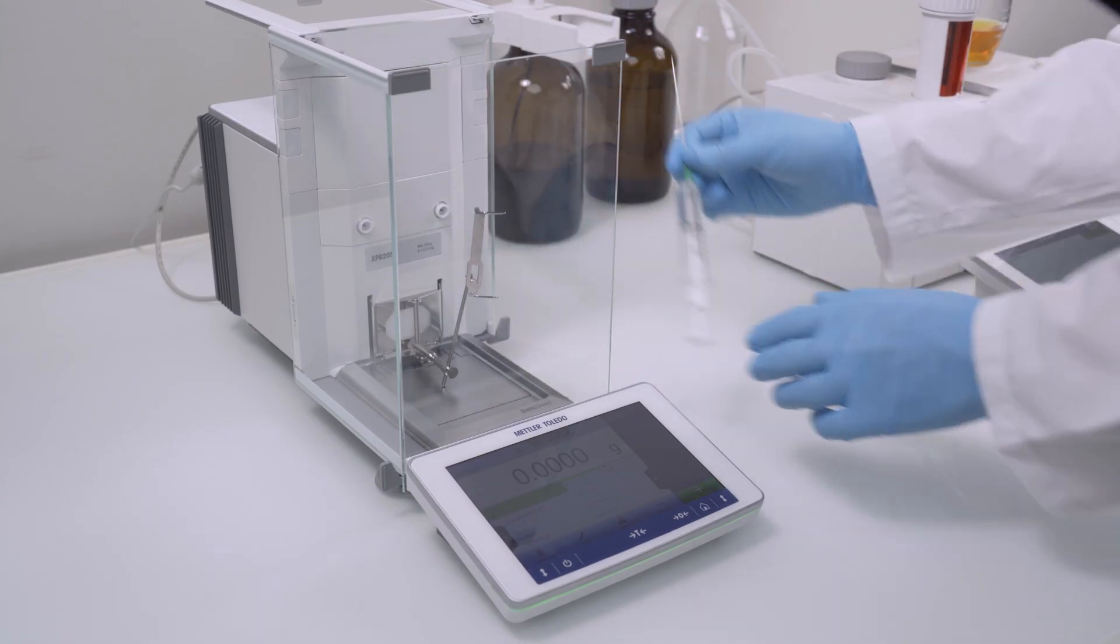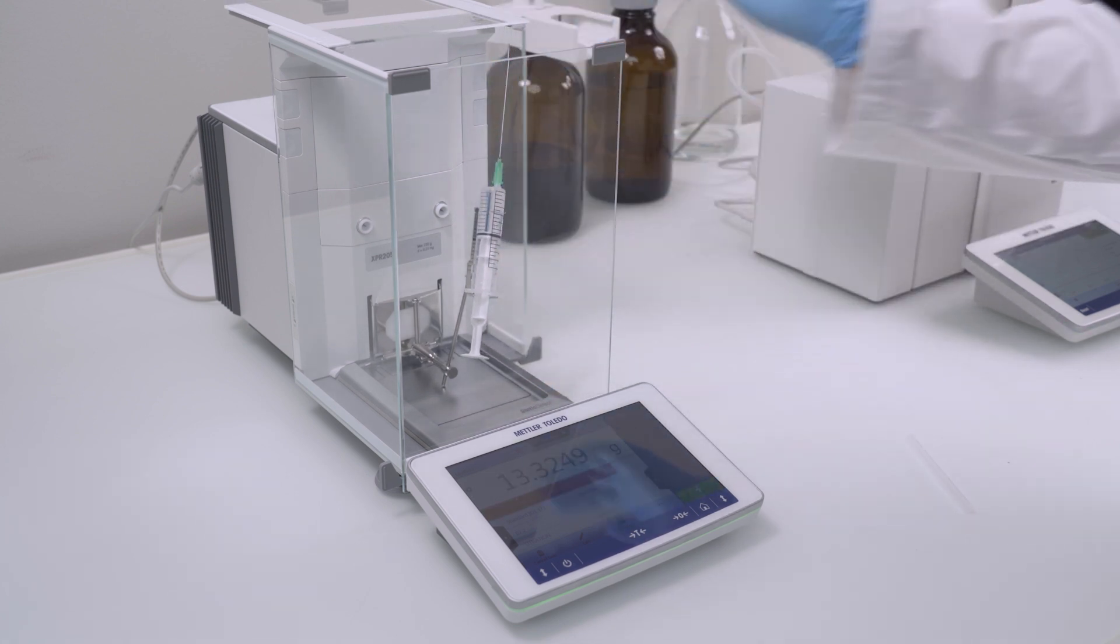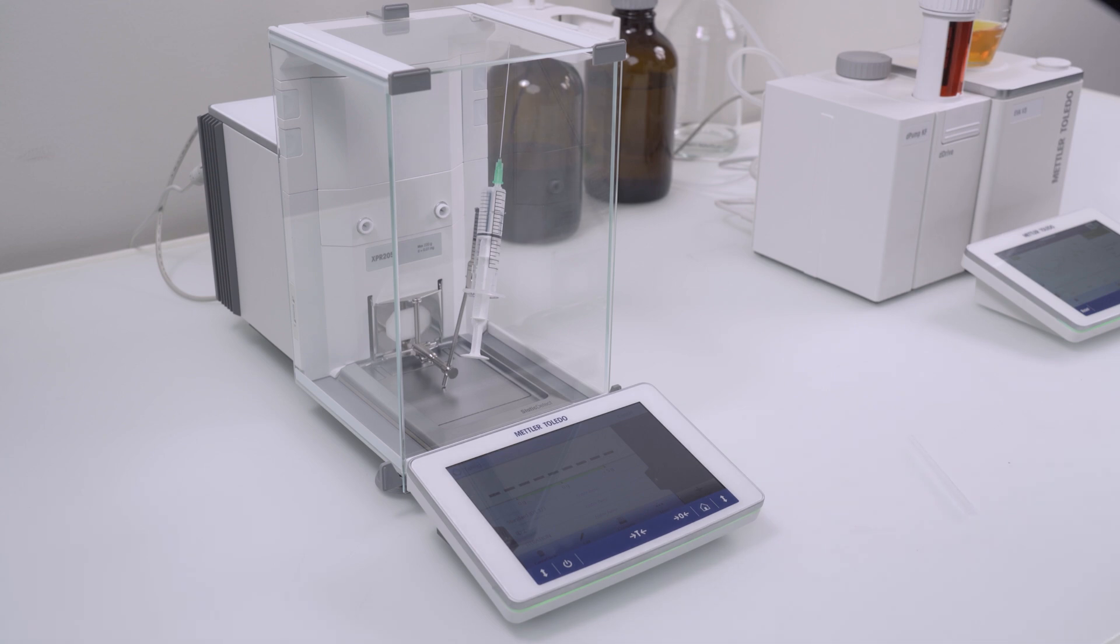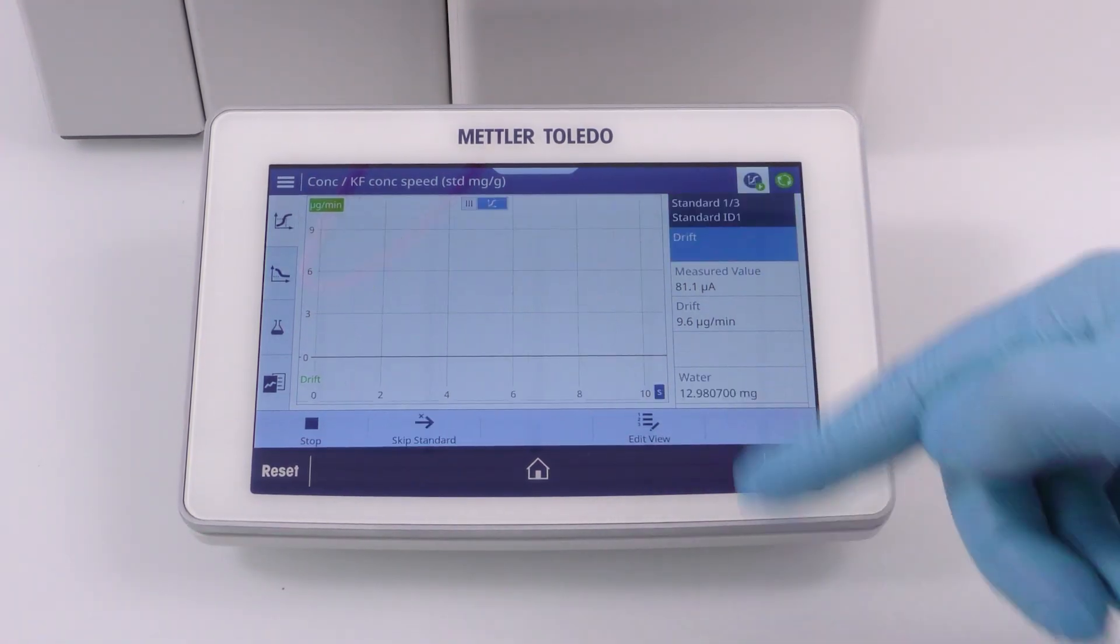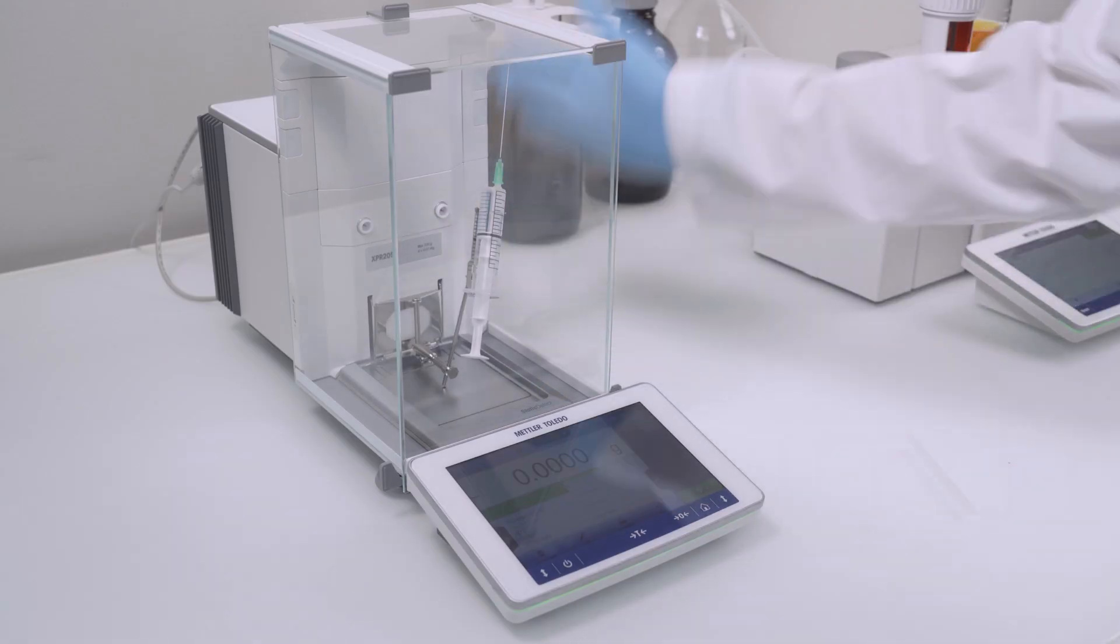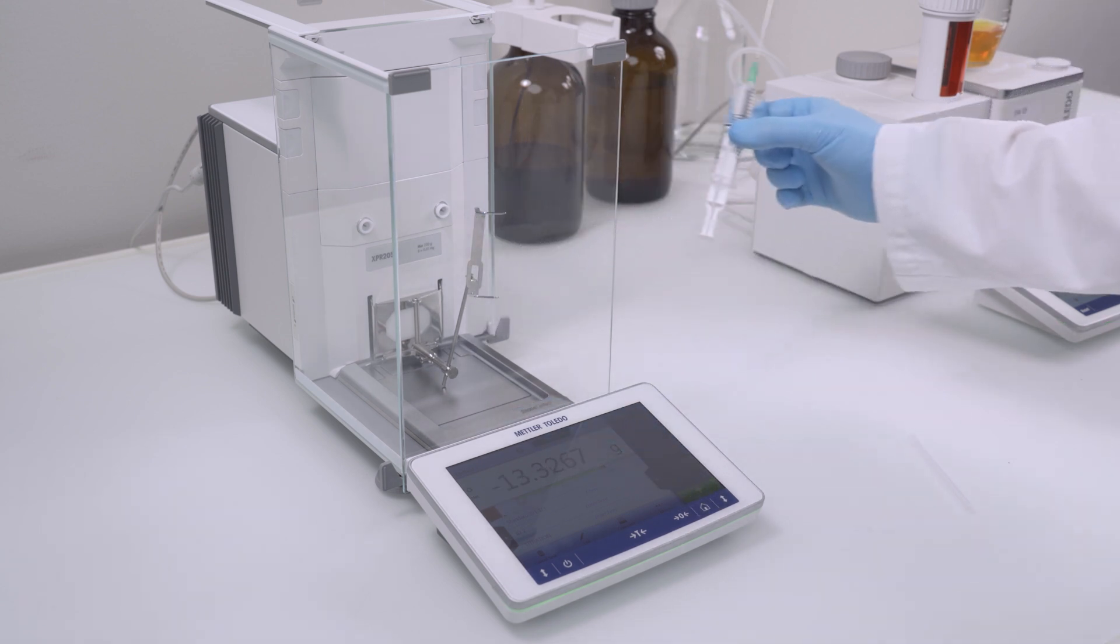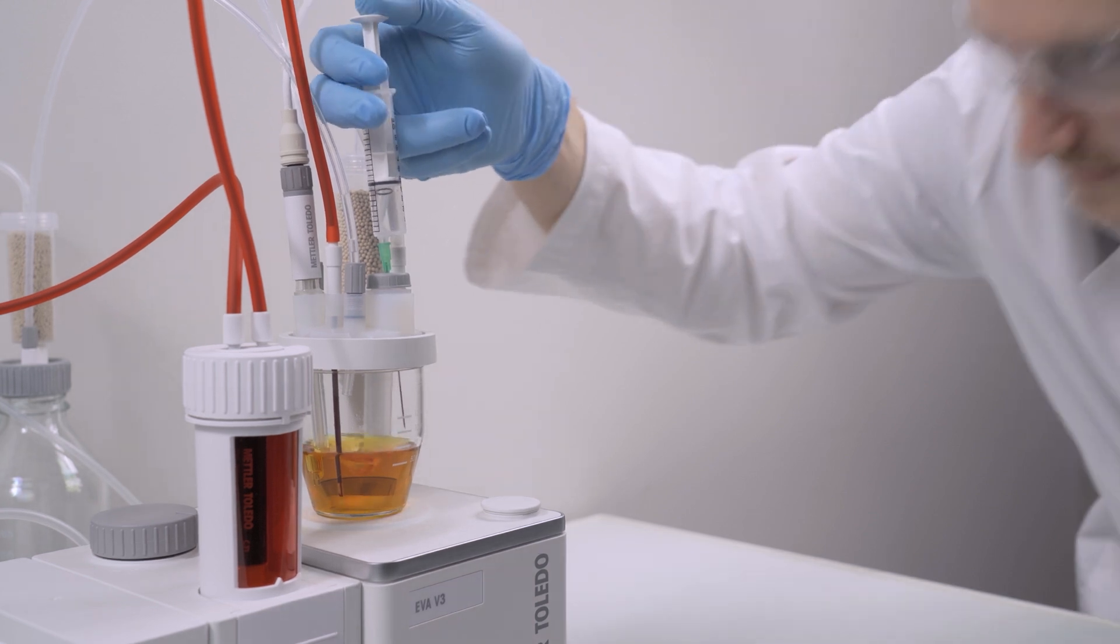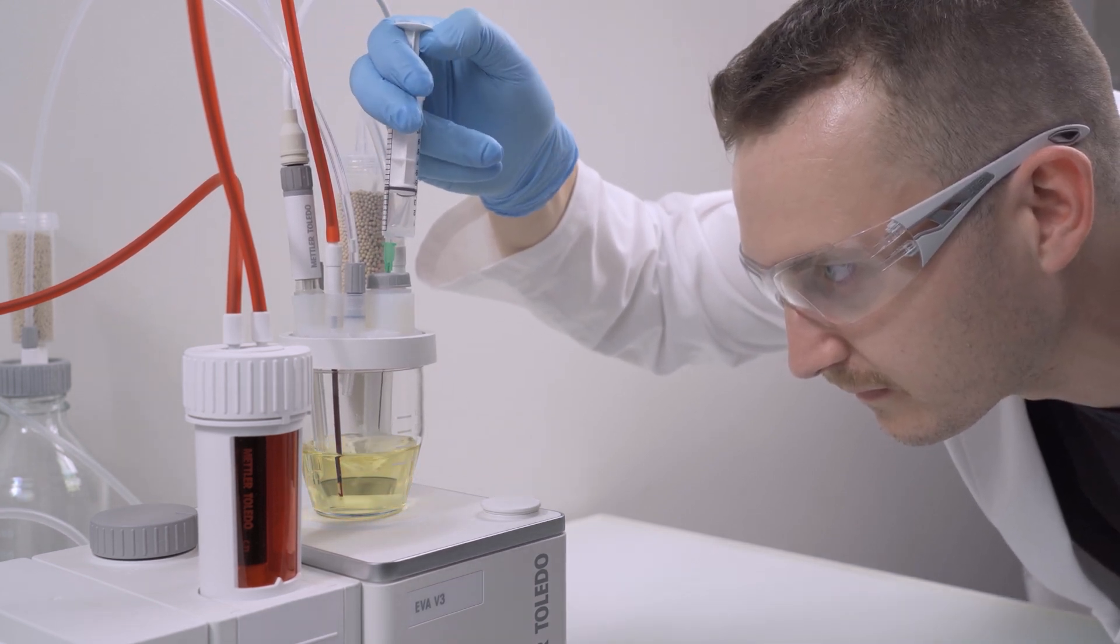Tare the full syringe on a suitable laboratory balance. Click on Start Standard and inject a sample with an absolute amount of water of around 10 mg. The sample has a water content of 10 mg per gram. Thus, I inject here 1 gram of sample. During injection, watch the tip of the needle and make sure that every single drop reaches the solvent.